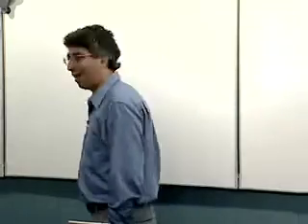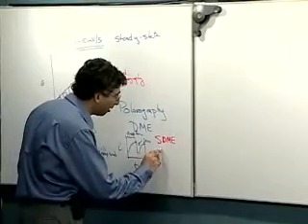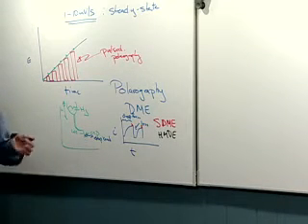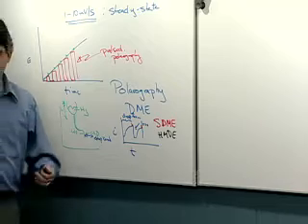So that brings up yet another technique, which is the hanging mercury drop electrode. In other words, you have a drop there, but you don't let it drop. And that allows you to do CV or bulk electrolysis or things like that.